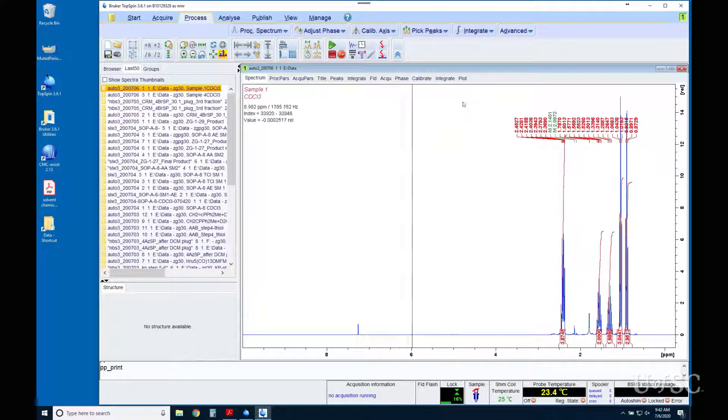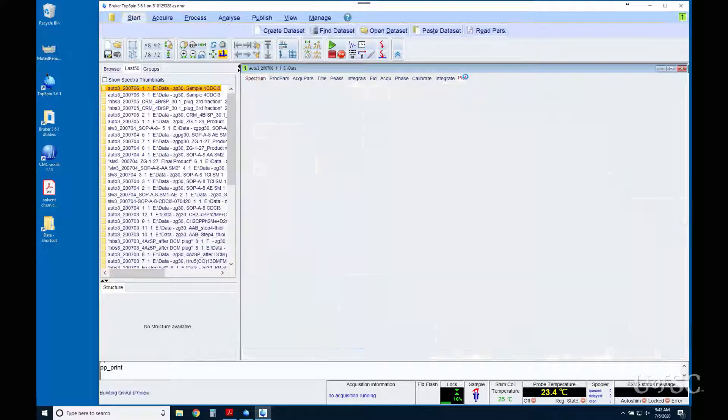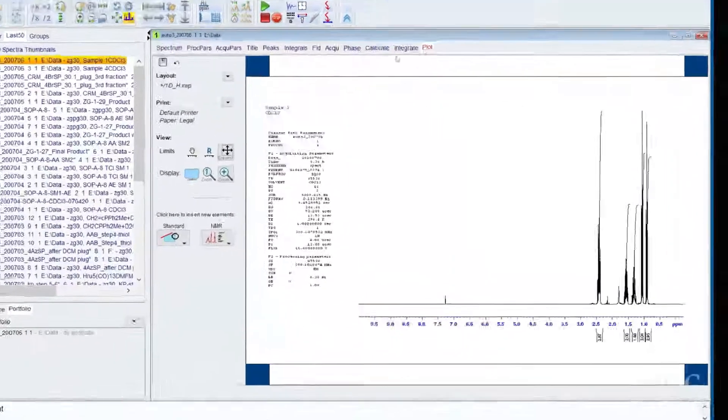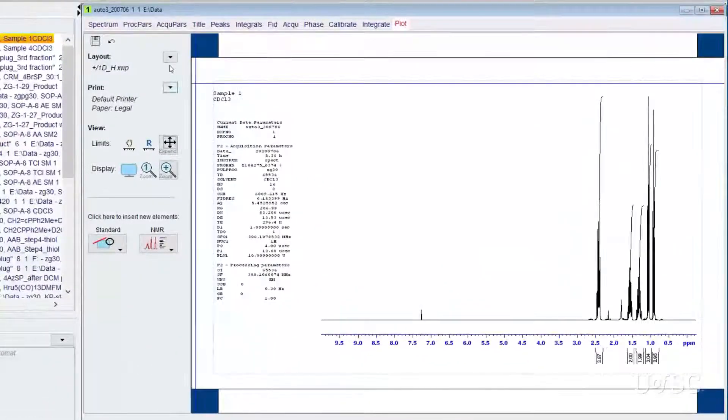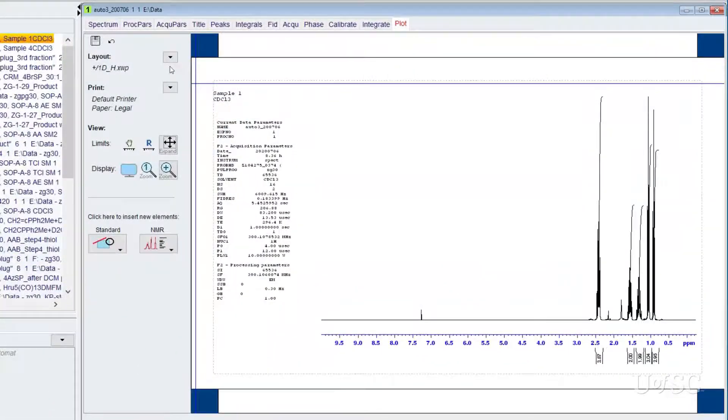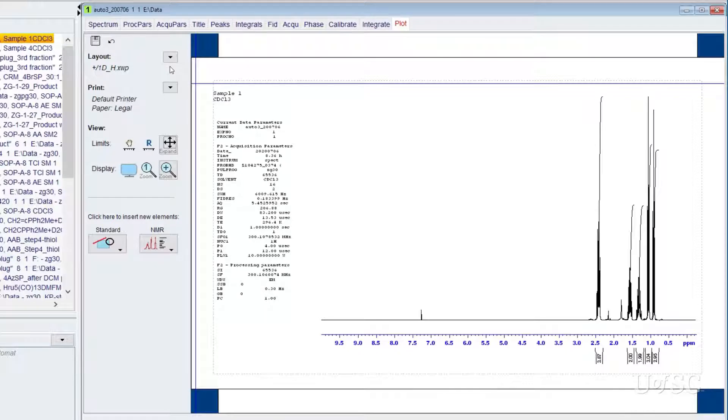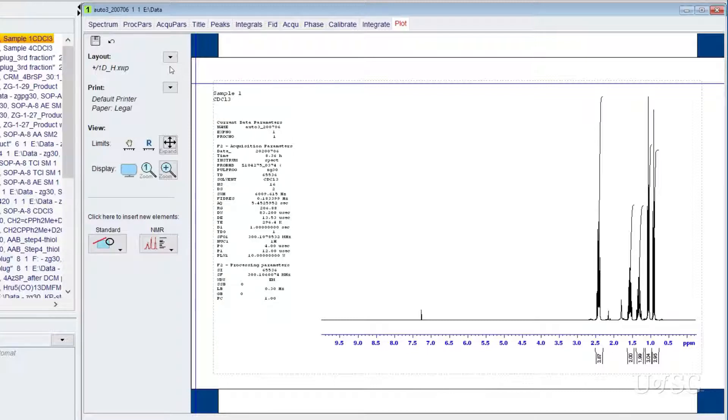Next enter the plot editor by finding the plot tab and left clicking it. This is the plot editor. To the right is the page layout where you will find your spectrum in a what you see is what you get format. This is how the printed page should look like.